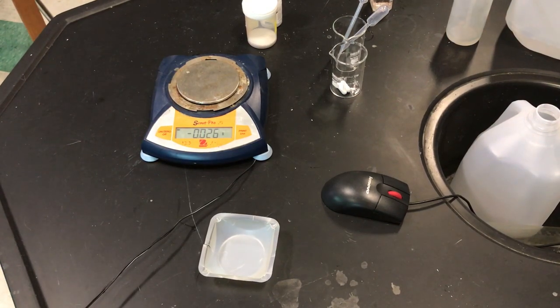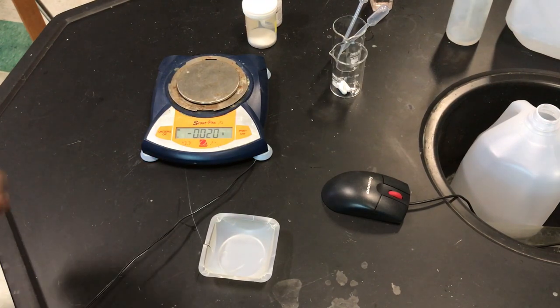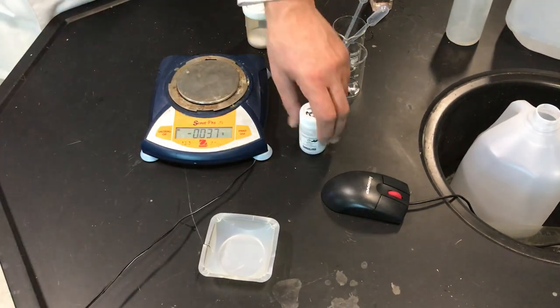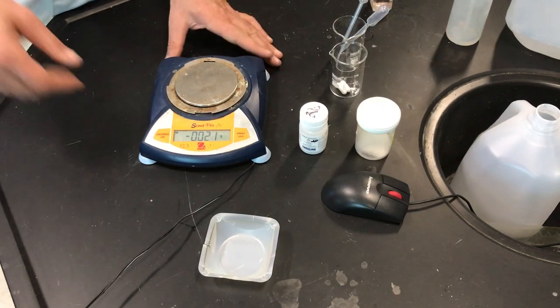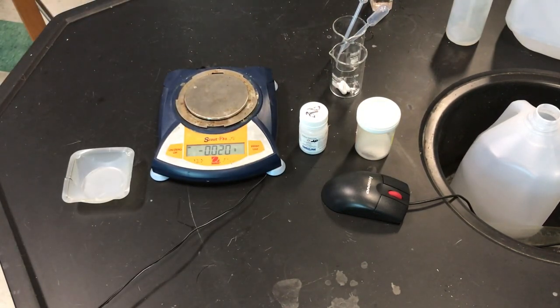Okay, all right, so we're getting our goggles on and the equipment we're going to need is our solid base, we're going to need some KHP, and we need a weighing boat and a spatula.